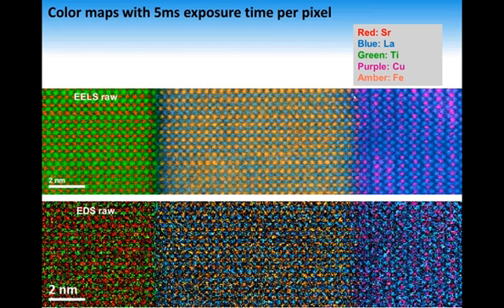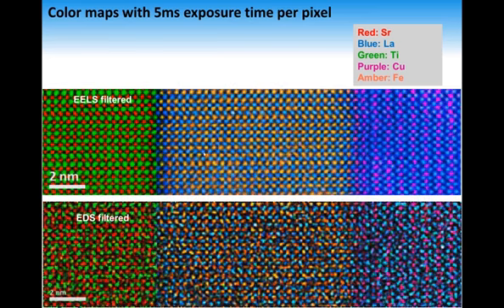You actually see the diffusion of copper into the iron. So this column here is made of iron and copper. And this column is basically completely not visible in the EDS map, and you can't really distinguish the two columns here. What you have to do is filter.